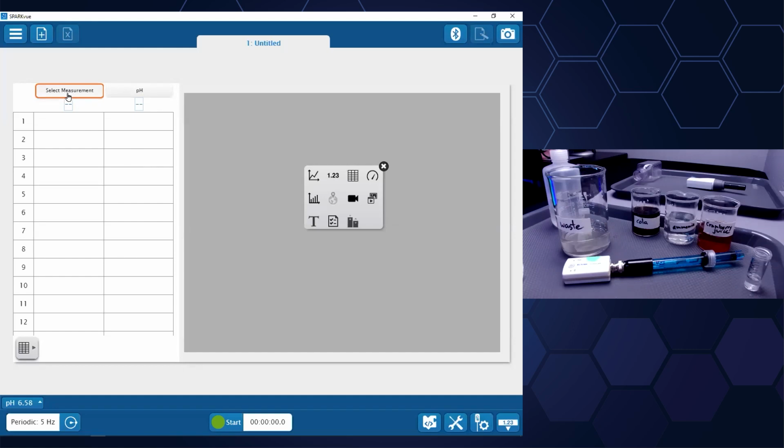Now, what do I want in the other column? Well, I think for the majority of you who said you'd view the pH in the digits display, knowing what you knew coming into this, and you'd write the values on paper, you probably would have constructed some sort of table that would have had pH and the name of the chemical. So what I want to do is have a column here with the substance name. And there are a couple ways to do this, but I find the easiest to be the following.